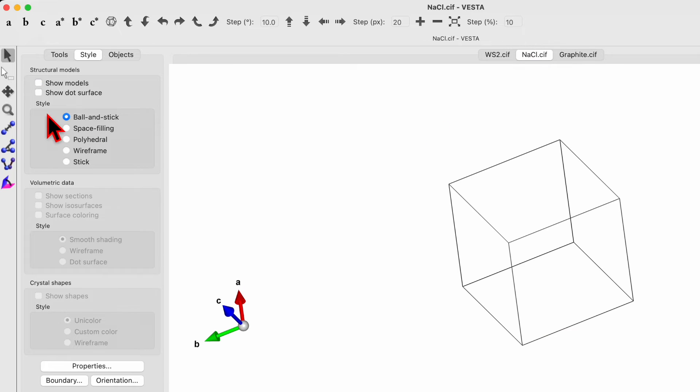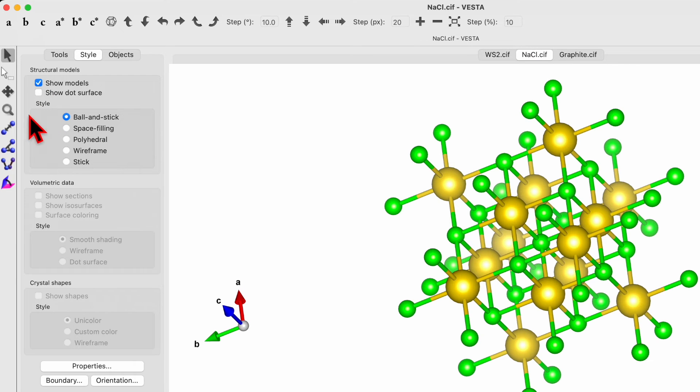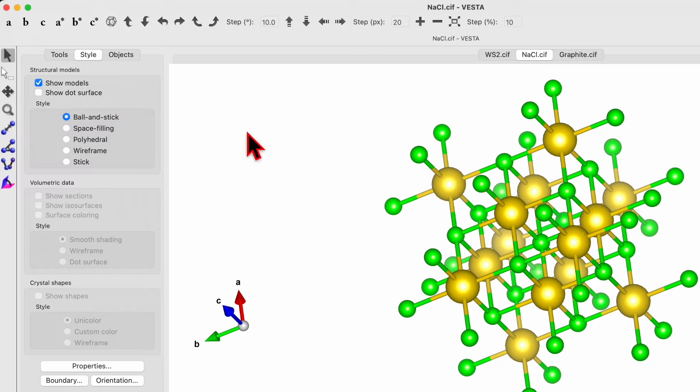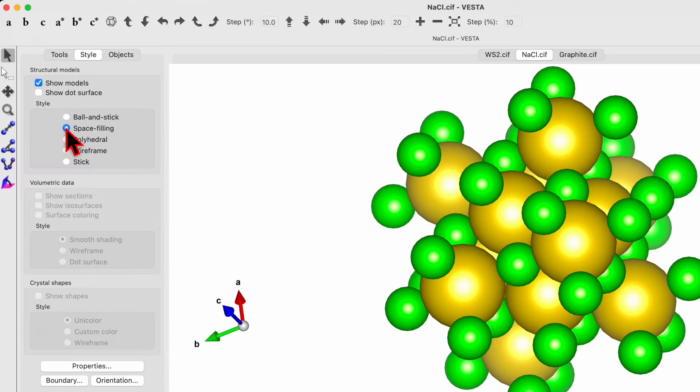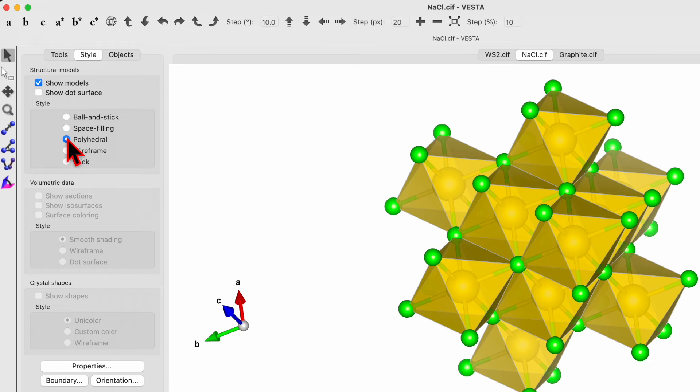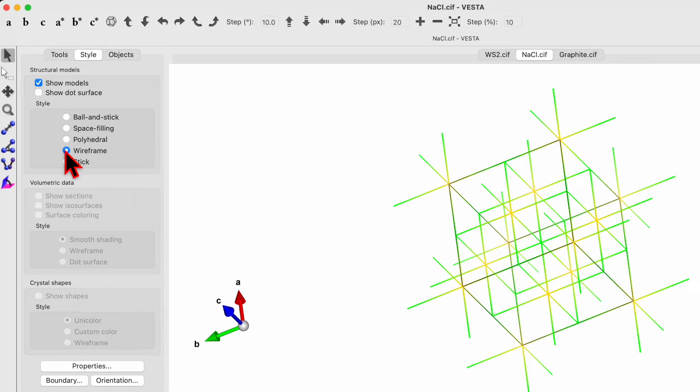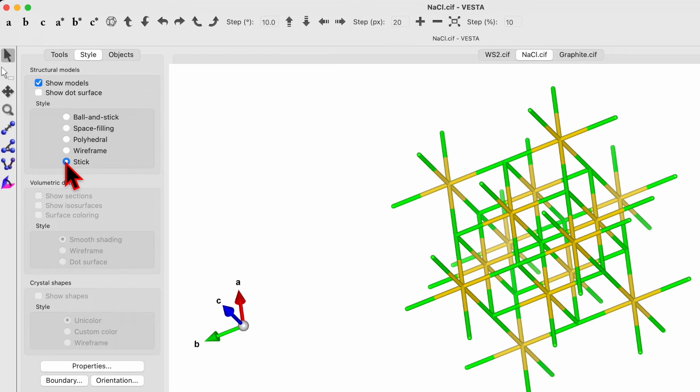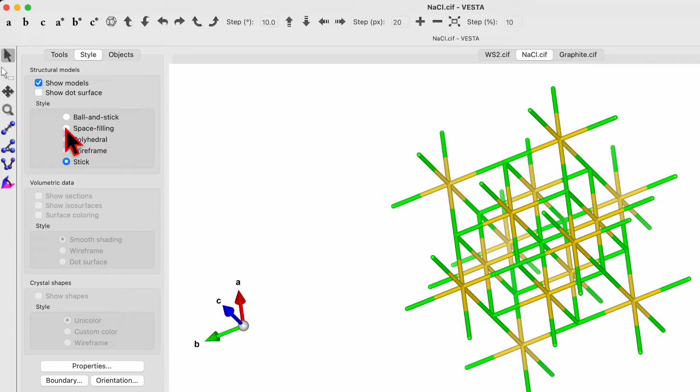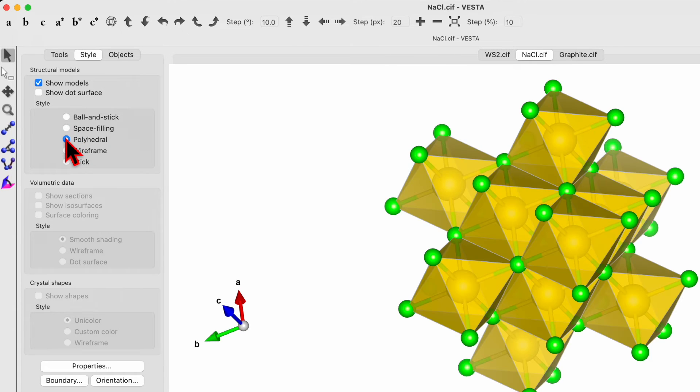So back to NaCl, show model. Now here you will see ball and stick. So right now we see the ball and the stick. If you choose the space filling, it will change like this one. If you check the polyhedra, it will look like this one. Wireframe look like this one. And the stick look like this one. So you can choose different formats to present your same unit cell.